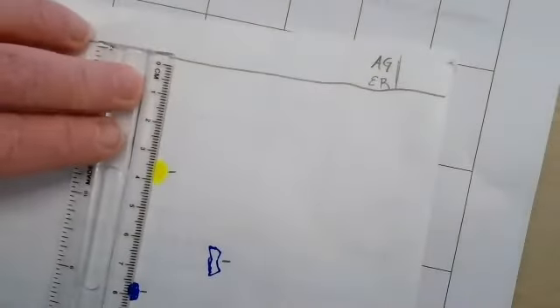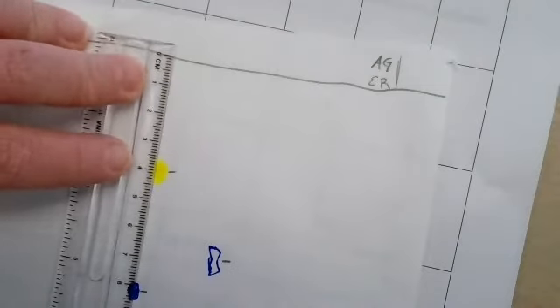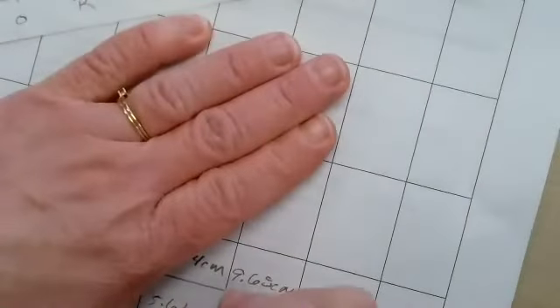Then the distance the solvent traveled. So for that, let's just say 9.68. And it's going to be the same for both. So I could write it again or just realize it's the same for both.